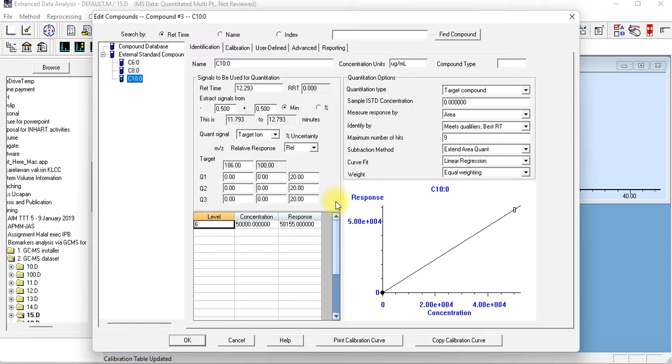That's why, for registration of a compound, choose the highest concentration first. Then afterward we will go to the lower concentrations. Okay, up to here okay? Proceed. So you just click OK.